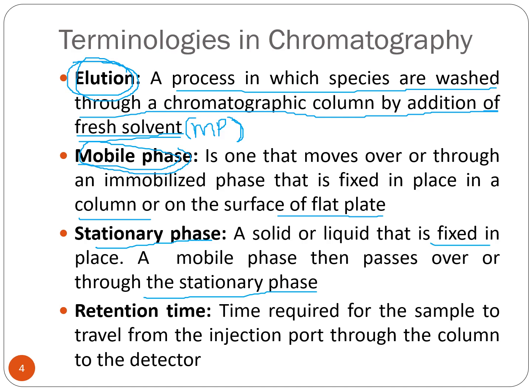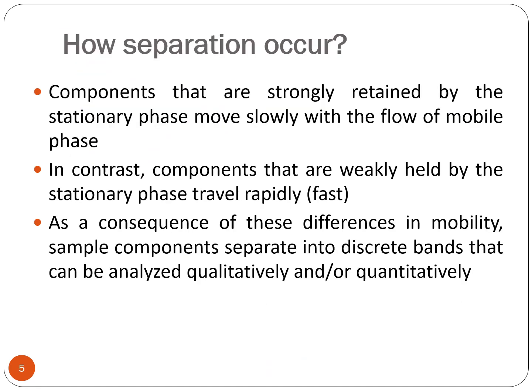And then how about the retention time? Okay, retention time is the time required for the sample to travel daripada injection port through the column to the detector. Berapa lama masa dia berada daripada being injected and pass through the column sampailah ke detector. So bila sampai kat detector tu lah yang akan keluarkan chromatogram. Ni untuk yang machine punya lah.